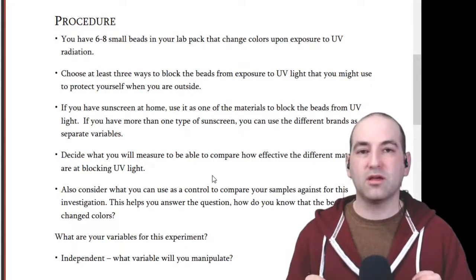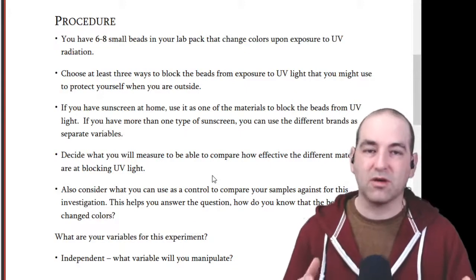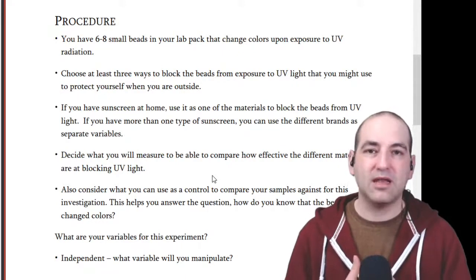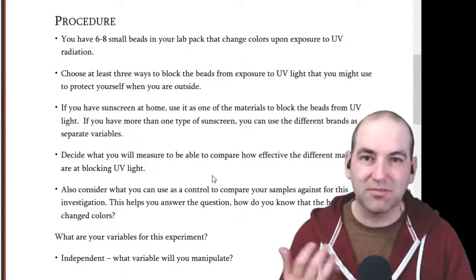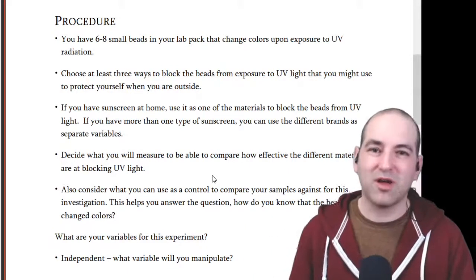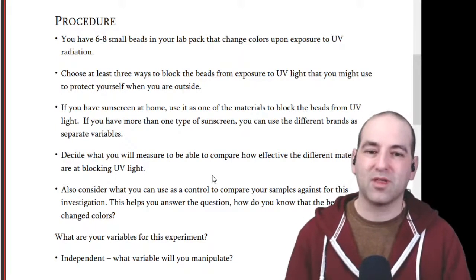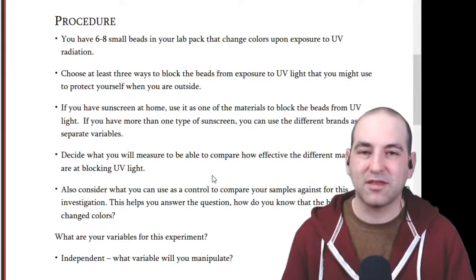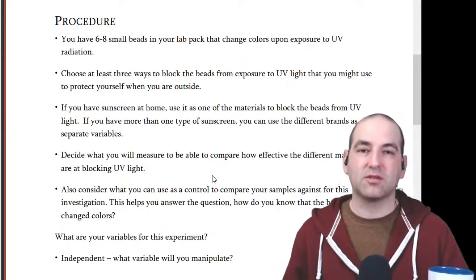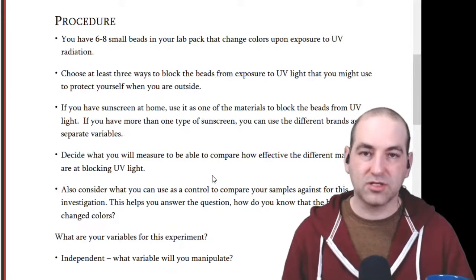So another test might be to look at the sunscreen and then take some other kind of cream or soap or whatever, something that has the same consistency as the cream but is not sunscreen. If you're using spray sunscreen, maybe you use bug spray or a spray lotion of some sort. If you're using a cream sunscreen, maybe you use a hand cream that doesn't have any SPF in it. So then you can see, is there anything else in those creams that's causing the UV light to be blocked? Or can we actually say that it's for sure the sunscreen ingredient?